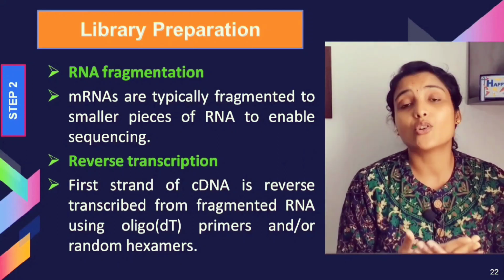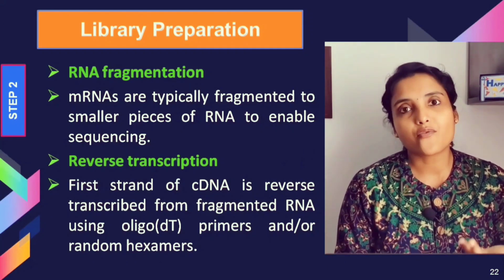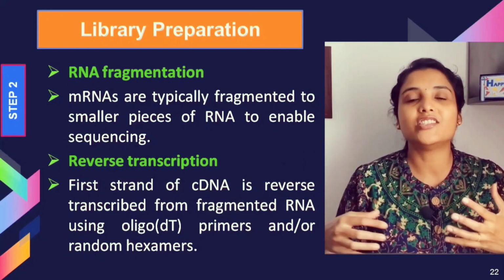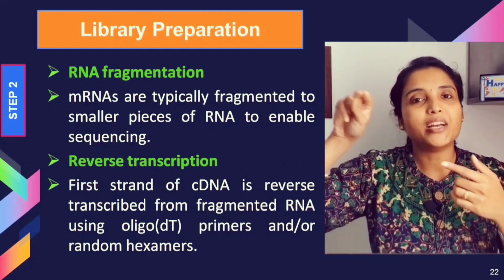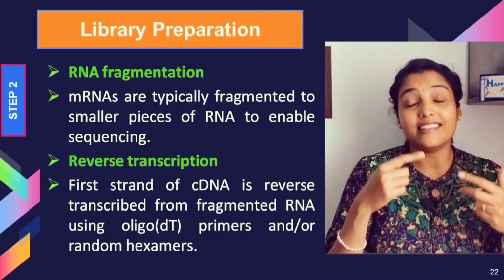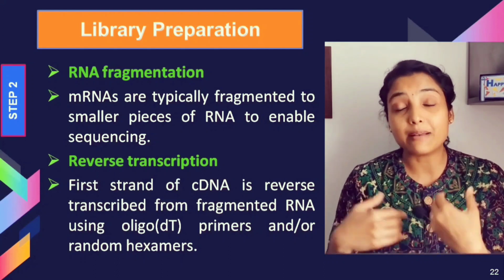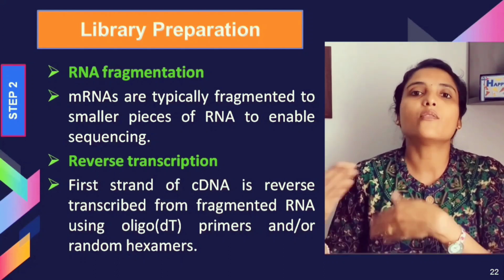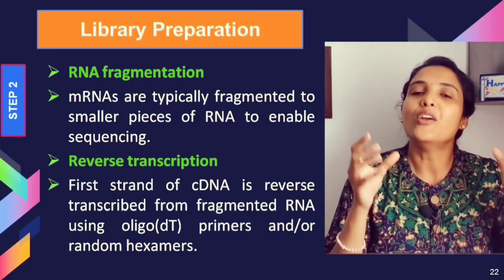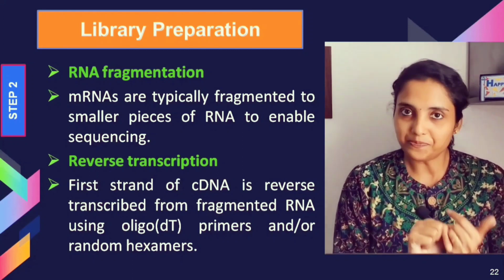It is done in the presence of an enzyme called reverse transcriptase, which is specifically isolated from retroviruses, because viruses have viral RNA. They have their genetic material as RNA, and to get into a host, they actually need to reverse transcribe the RNA to DNA so that they can integrate themselves into the host, and when the host replicates, the virus also replicates itself. So basically, that is why they have it. We use these reverse transcriptases to carry out our reverse transcription reaction.